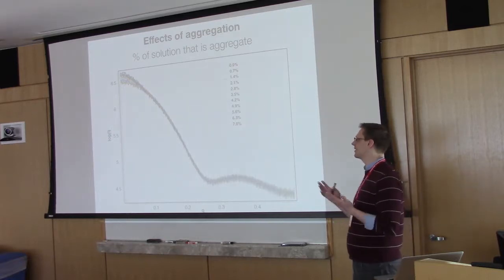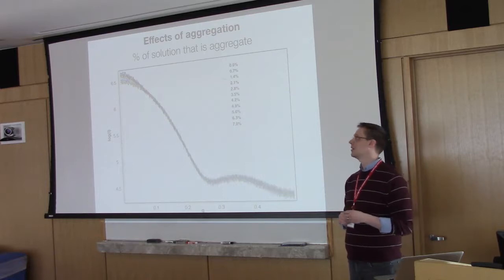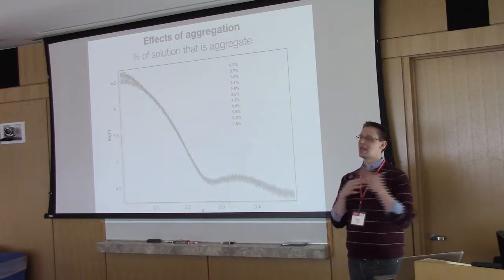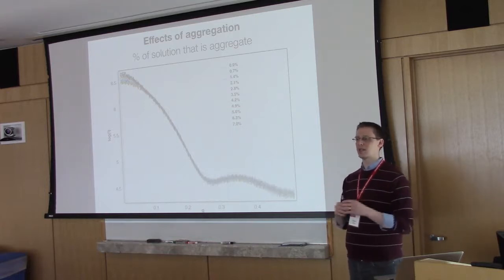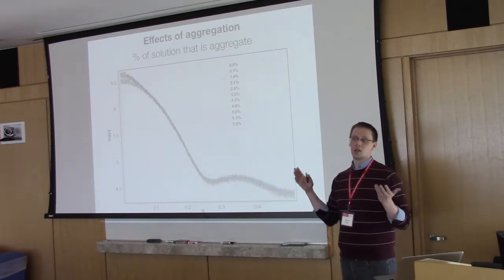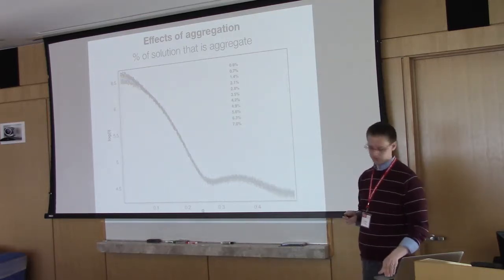So I think it typically uses something like 10,000 beads, and depending on the size of the particle, it'll fit the size of the bead so that there are about 10,000 beads. So if you've got a 100 kilodalton particle, that's maybe a Dmax of 100 angstroms, it'll probably have a 3 or 4 angstrom radius for the beads. So it's very coarse grained, typically.